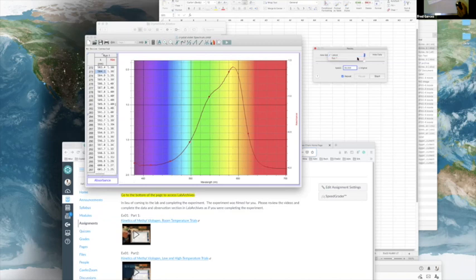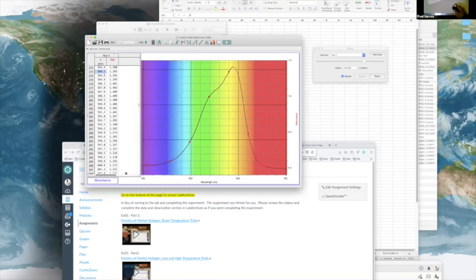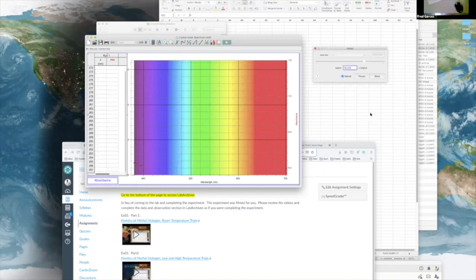Oops, that's run 1. You got to go over here and do run 1, because if you look at the original data right here, what you will see is that there is no latest run. There's only run 1. So you can just click on these handles and expand it. So I'm going to do run 1, and I'm going to click on start.